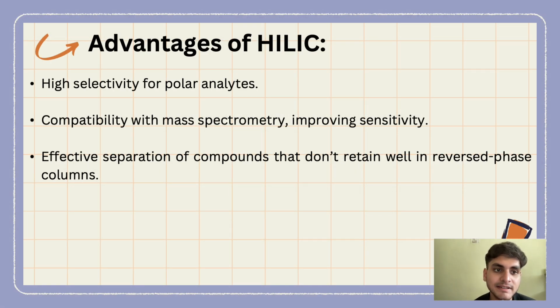Advantages of HILIC: high selectivity for polar analytes, compatibility with mass spectrometry, improving sensitivity, and effective separation of compounds that don't retain well in reversed phase columns.